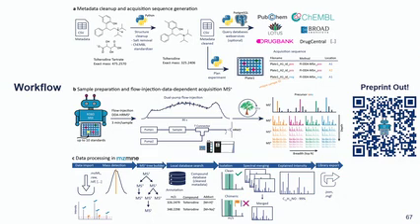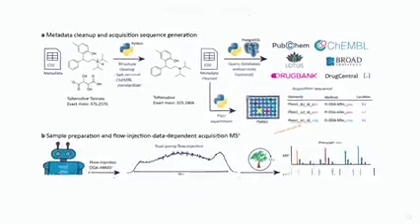And that's when we worked on this workflow idea. So we separated it into 3 different steps, and I will not cover everything in too many details. There's also the preprint out, so if you're interested in more steps, feel free to read it, and then you get more ideas also about the template, how to prepare the metadata, how the processing was done in mzmine, and so on. So everything is written in the preprint.